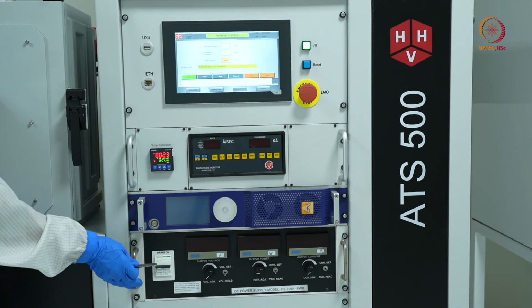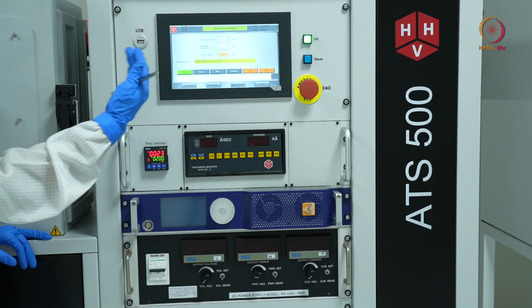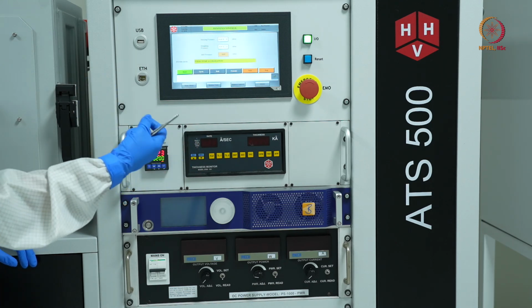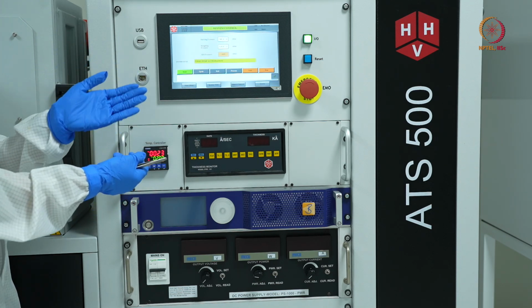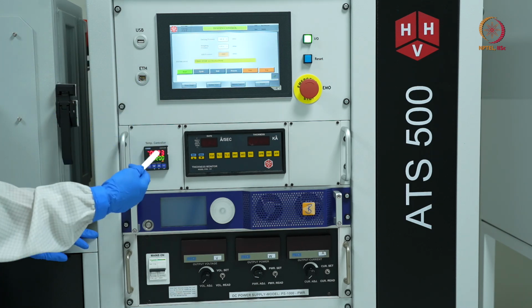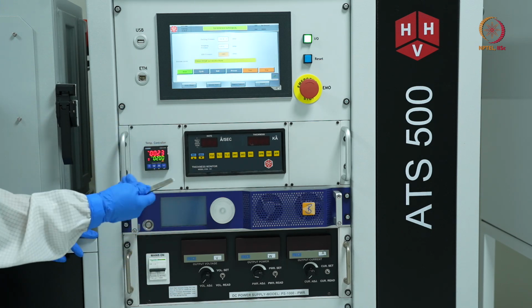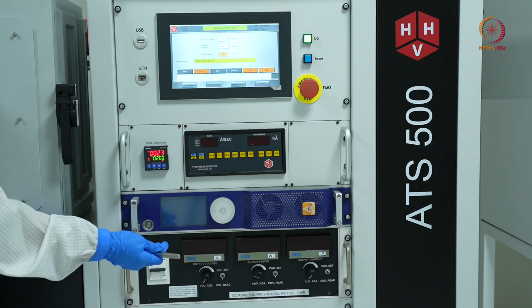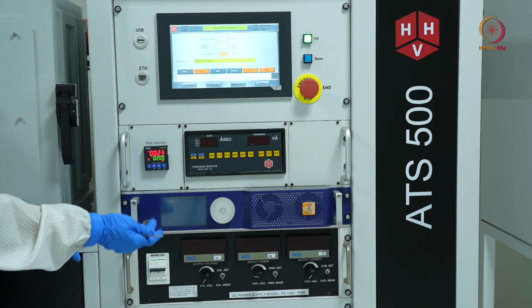So the difference between RF and DC sputtering is, suppose we are hitting argon atoms, which are ionized, onto a target. Now for these argon atoms to go into a neutral state, they will need one electron so that they come to a neutral state and go out of the system. When we are depositing any metal, metal has plenty of electrons, so easily the argon atom will get one electron from the metal which we are depositing, and it will go out of the system.